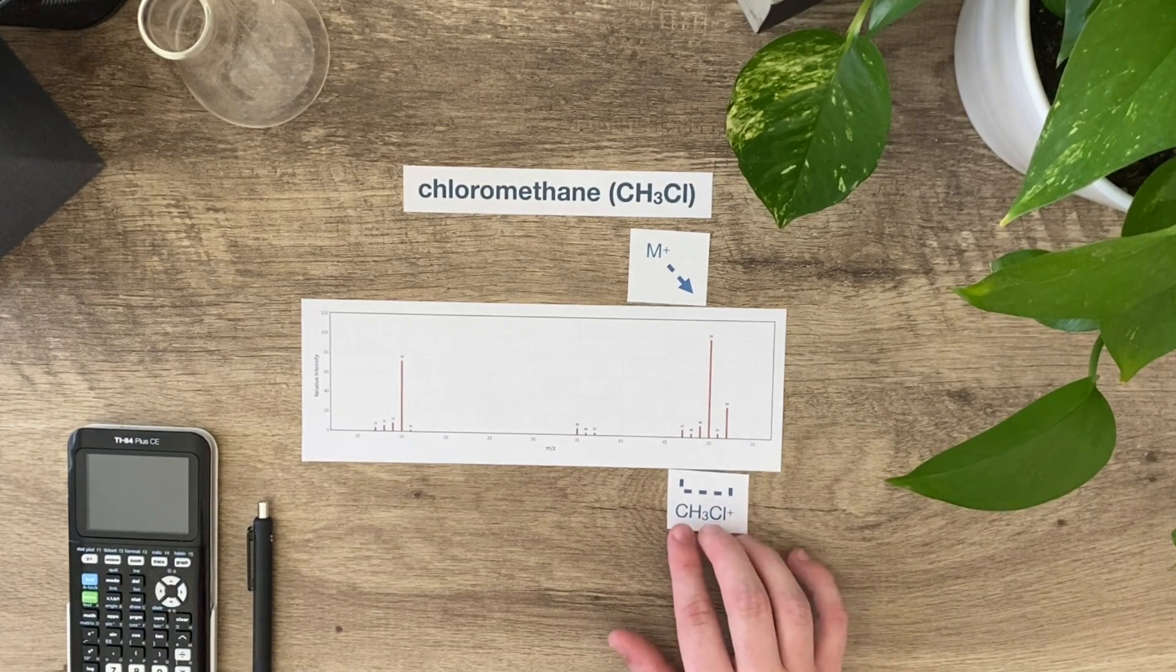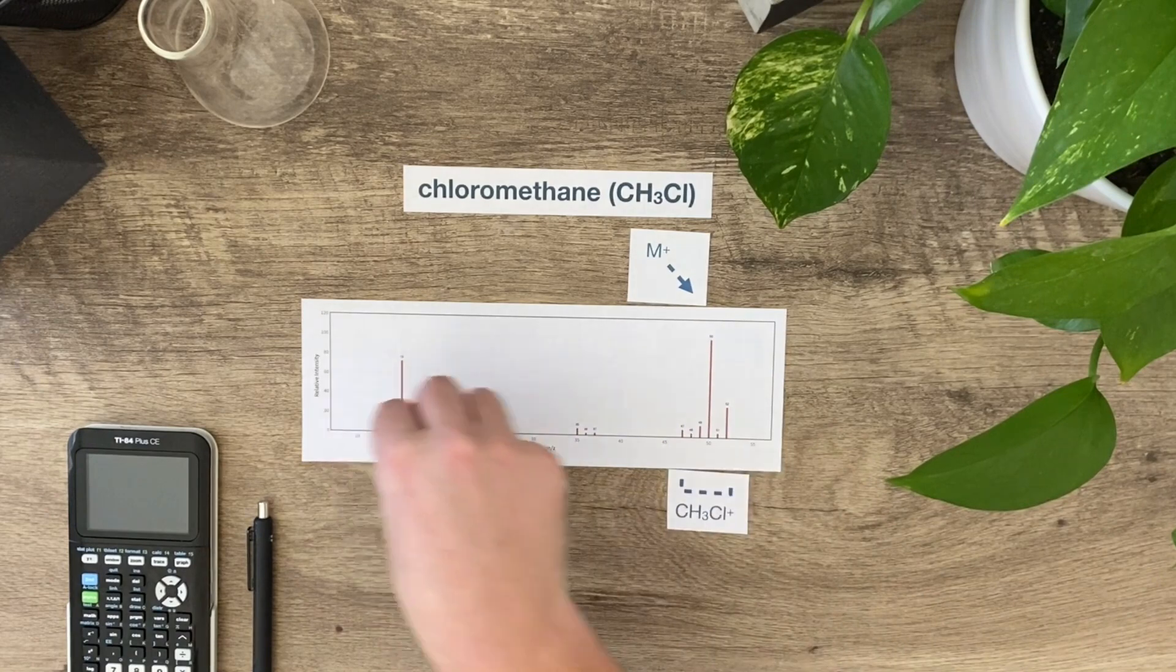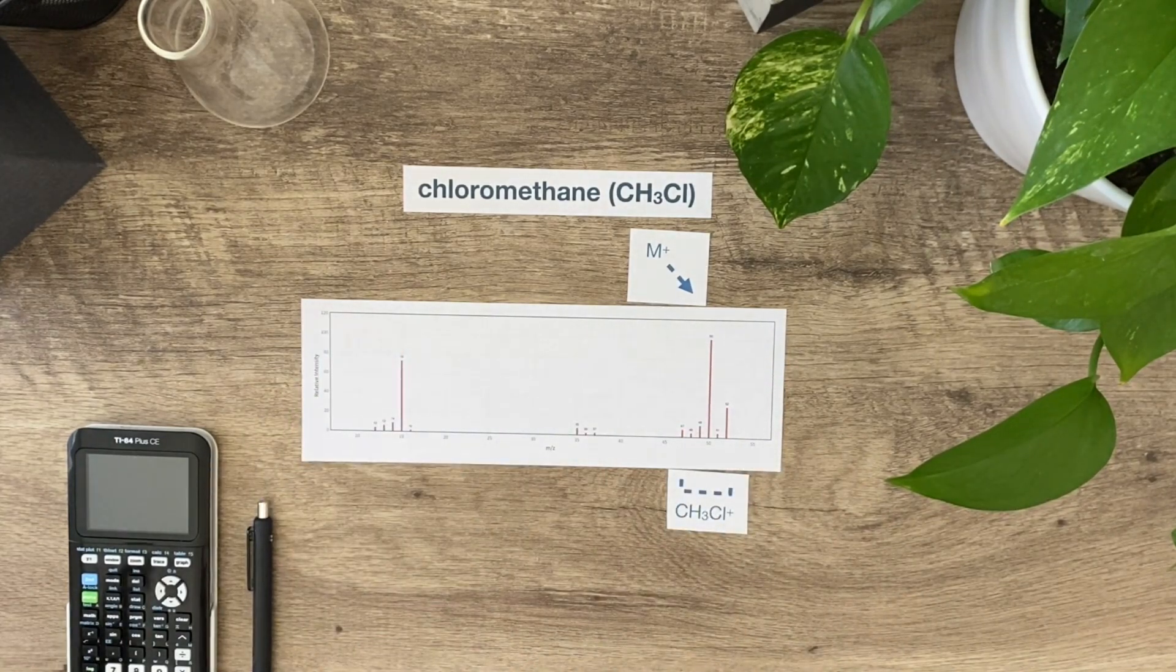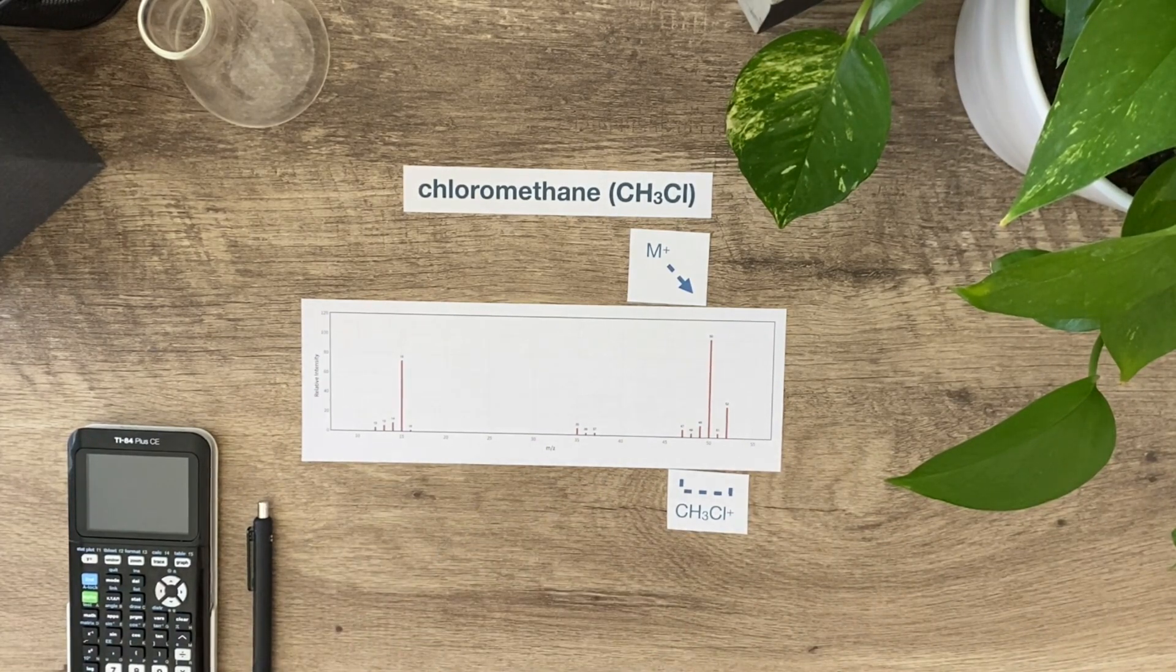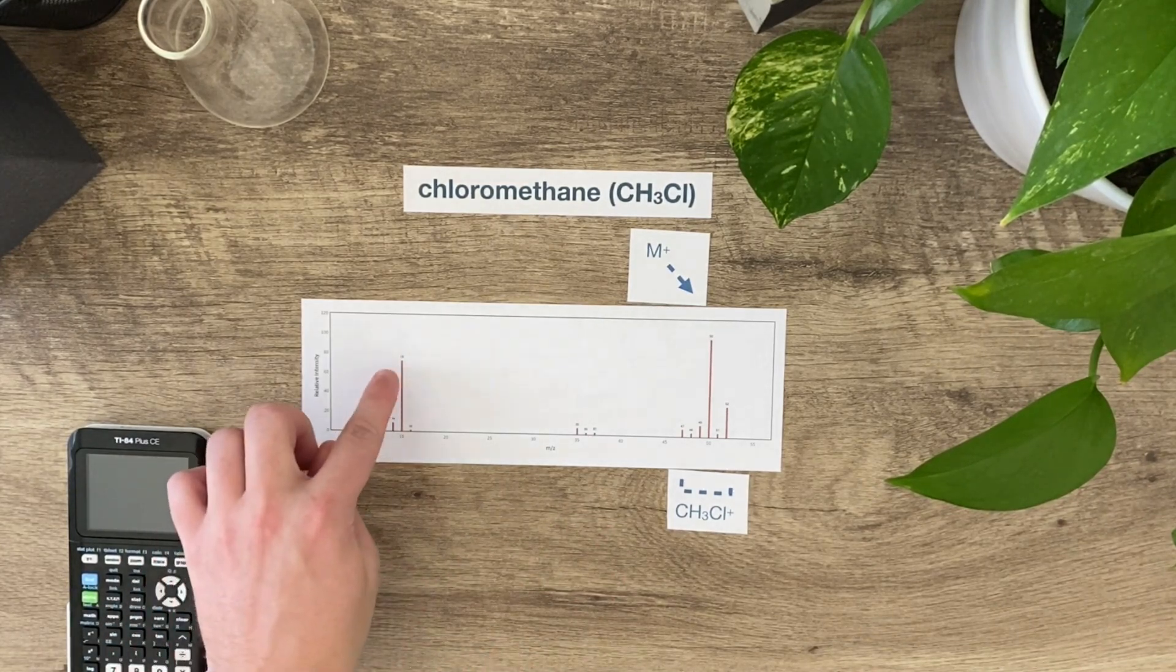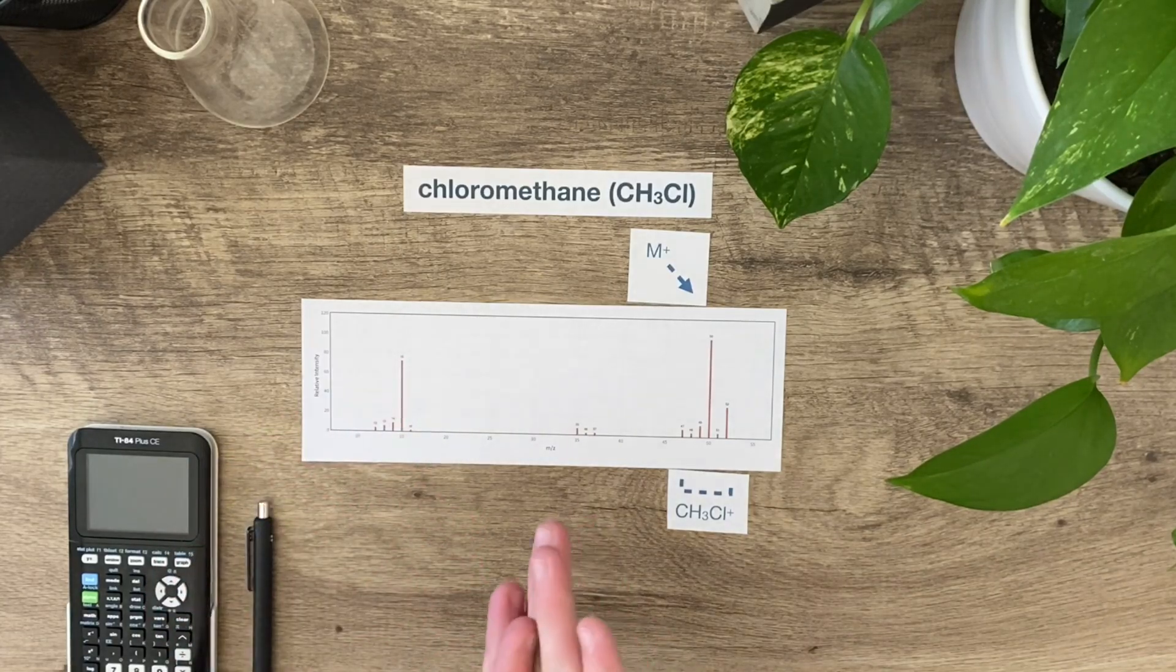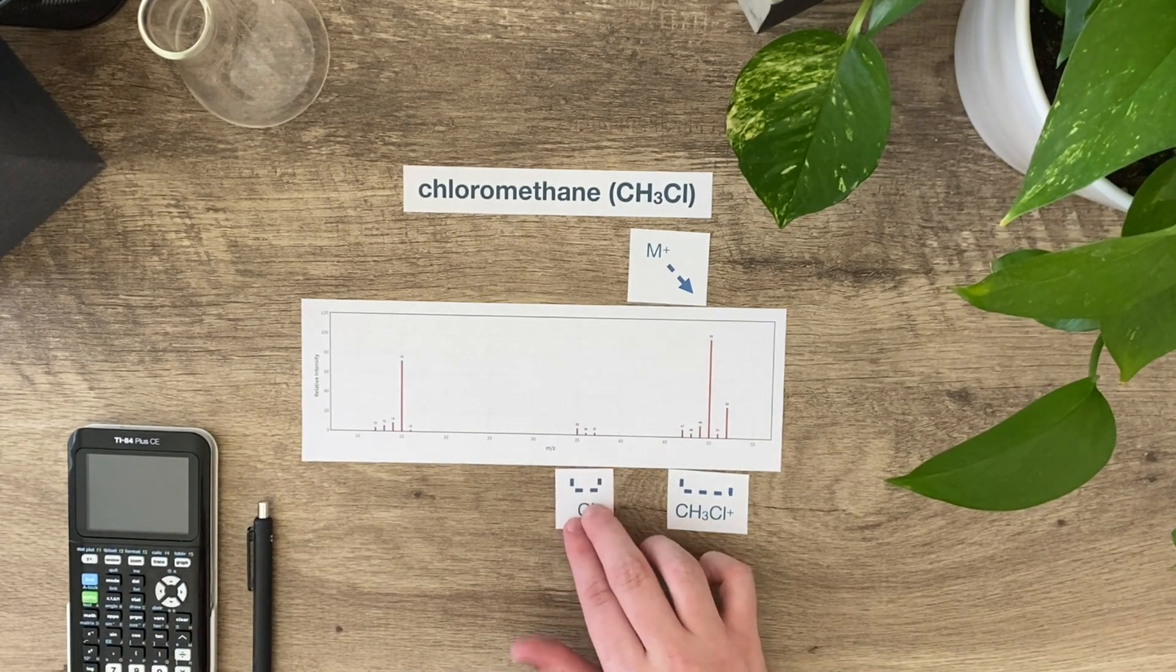CH3Cl+, so the ion stuck together. These two locations or concentrations are associated with something breaking off. This is 35. What do I think I can break off that would leave a mass of 35, and what can I break off to leave a mass of 15? Actually the CH3 and the Cl split, so this is representative of chlorine.